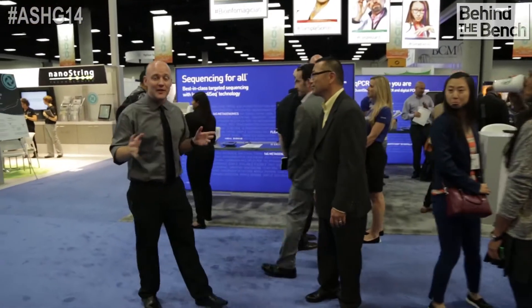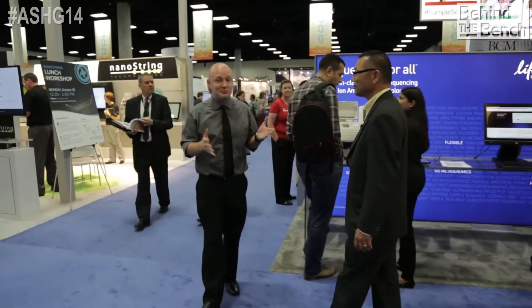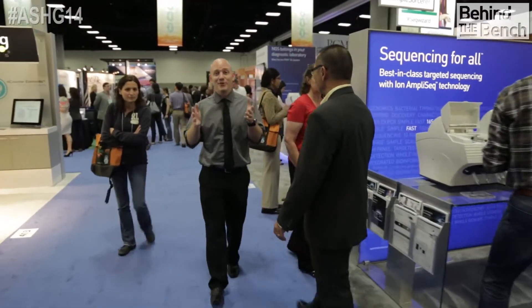At ASHG 2014 in San Diego, thousands are pouring into the exhibit hall, but we know there are thousands who just couldn't make it to the show. We want to reach those folks who could not make the trip out to San Diego and give you a flavor of what it's like at the Life Technologies booth.